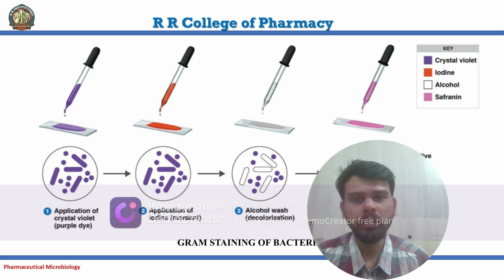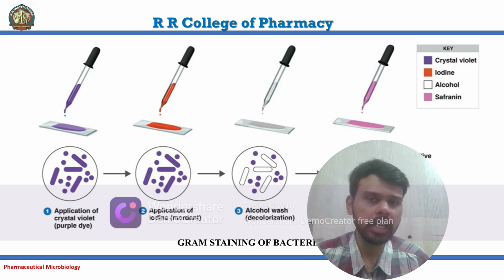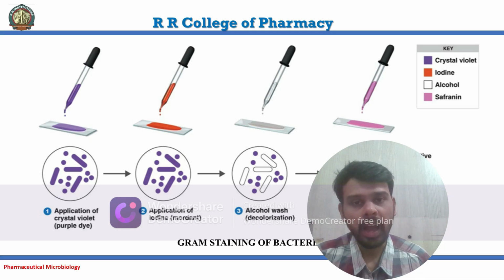So we need to check which kind of bacteria has which drug resistance or not. Due to this, we are able to differentiate the morphology, anatomical features, the cell wall and the different things involved in the bacteria.